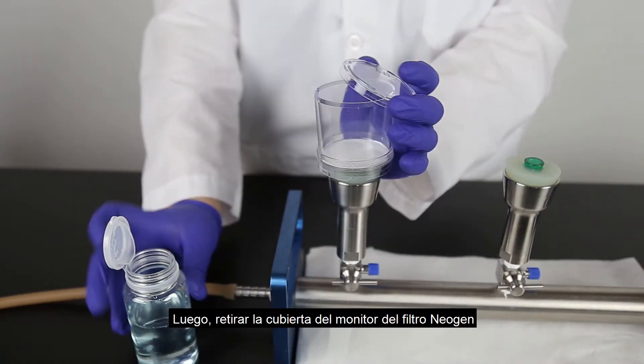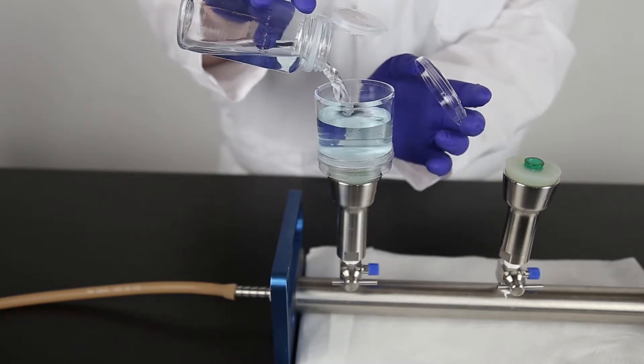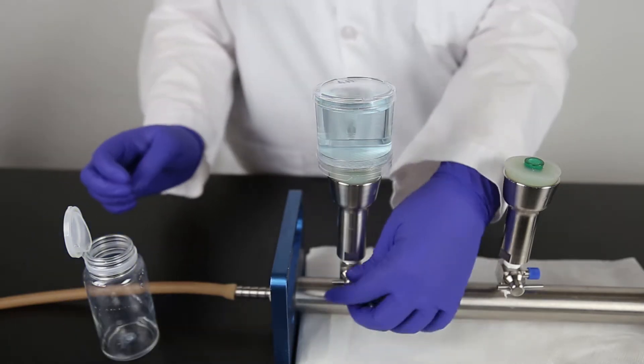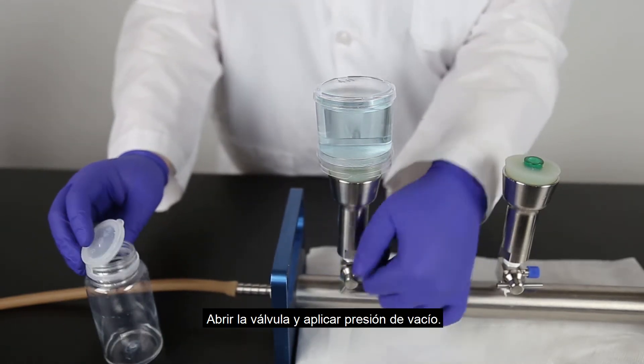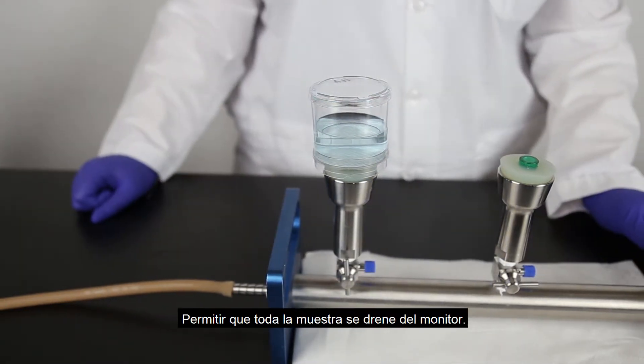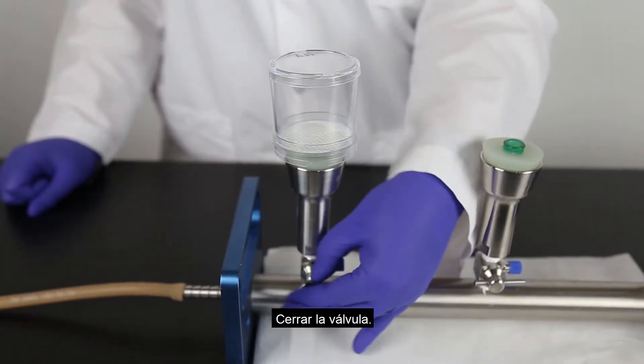Next, remove the monitor cover from the Neogen filter and aseptically pour your sample onto the membrane. Immediately place the cover back onto the monitor to prevent contamination. Open the valve and apply vacuum pressure. Allow the entire sample to be drained from the monitor, then close the valve.